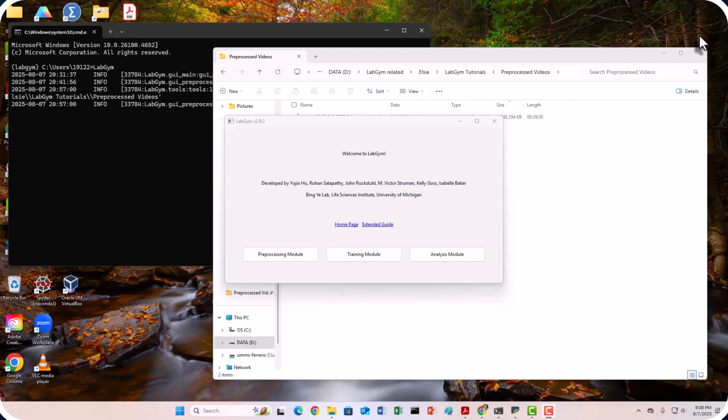It's typically done before you train a categorizer, and you're drawing markers only on the first frame of a video, and then they get applied to all of the frames of the videos. Therefore, your videos you hope to mark should have the objects you wish to mark visible, and they should be static in the first frame of your video. I'll show you an example of this in a moment.